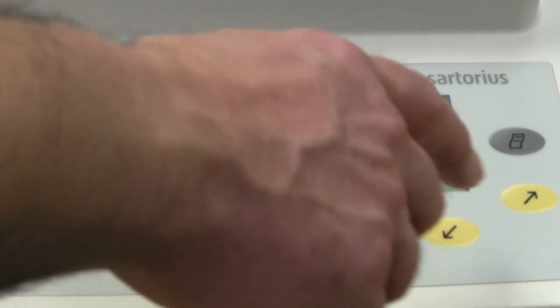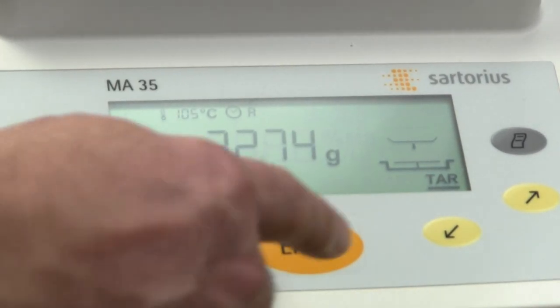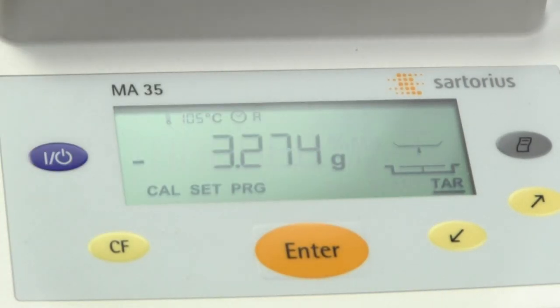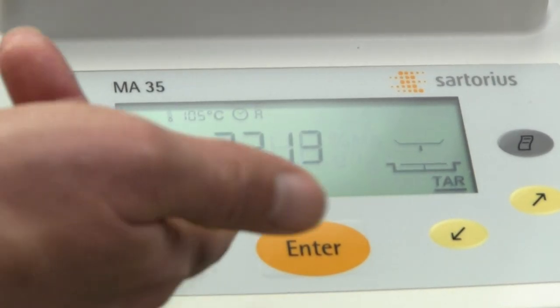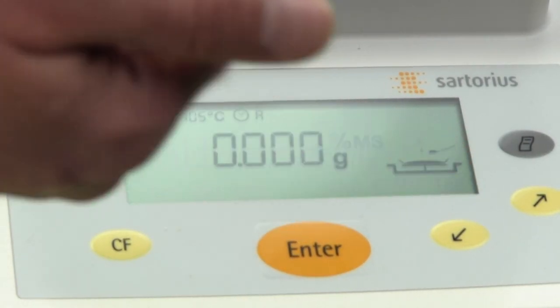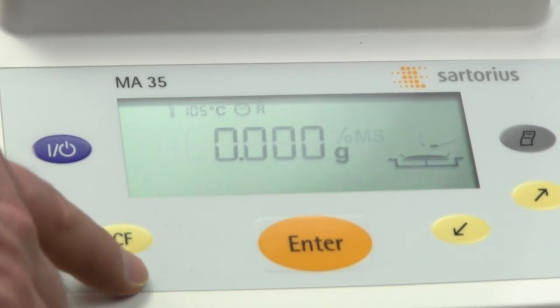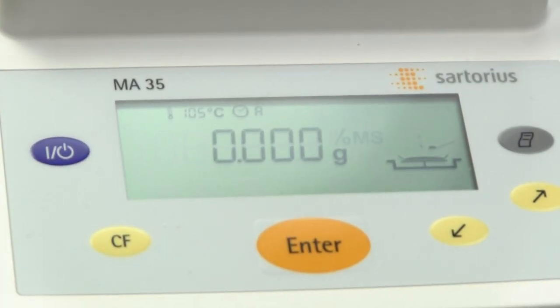There is also a cal function if you want to calibrate the balance, which requires an optional 30-gram mass. You just have the two arrow keys to control the lower menu and the enter key to select. The clear CF is the clear function, and there's also a power button and a print button. The print button is used if you're sending data to a PC or using the optional Sartorius printer.